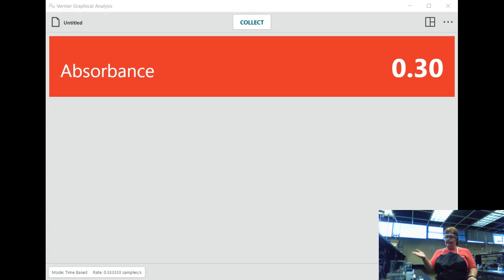So I have a little bit, but this is not as high as 1.11. So at 565 nanometers, the absorbance is 0.30. I have one more wavelength left, and maybe it's the highest. So I put my water in, I change the wavelength. Now it's on 635 nanometers. I hit cal, I wait for it to stop blinking. I check that it's reading 0 as it should be. Okay, stop blinking. And now it's on 0, good. And now I remove it and I put my stock solution in.